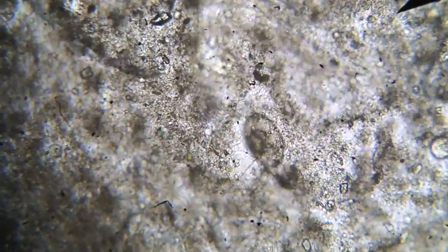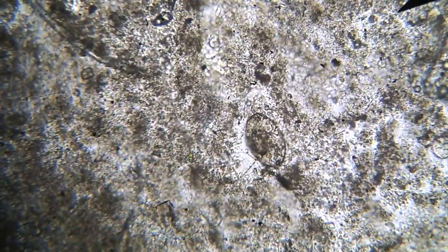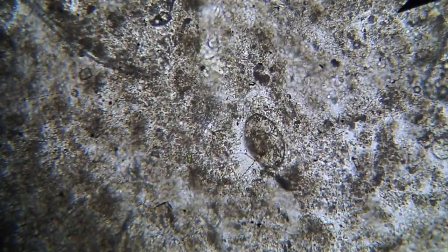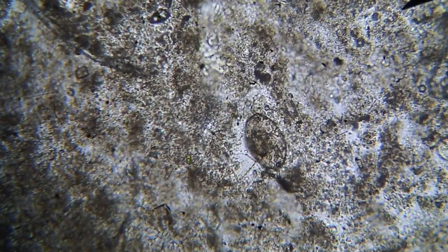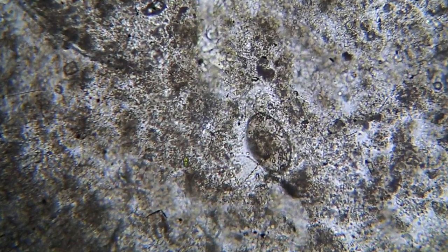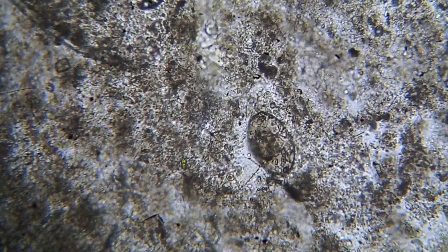Here we're looking at the stool sample from the common bristlenose catfish. Already you can see right in the centre of the screen is some sort of an oval shaped object — to me that does look like a worm egg. And as we scan around, I saw quite a few more. But to save you from getting seasick, I won't do that.